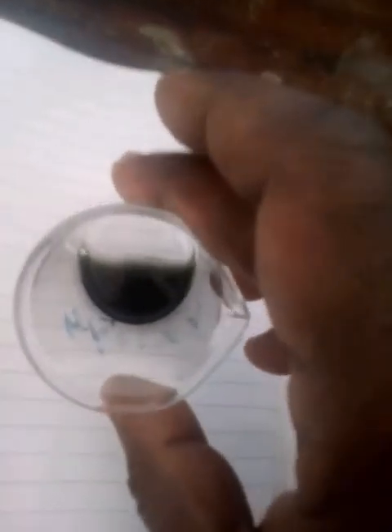Alright, so we add, and we are seeing we got a color change. Whenever iodine is reacted with starch suspension, you should get, theoretically, a blue-black color change, and that is what we are seeing here. So we're just confirming that the reaction took place.